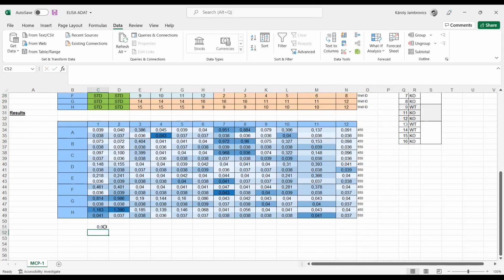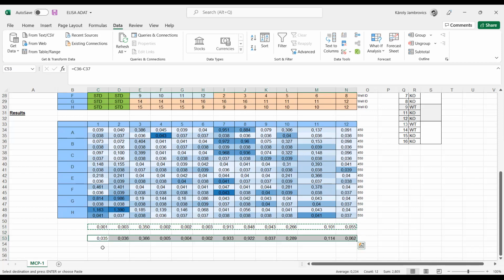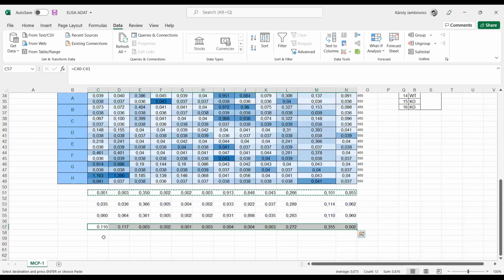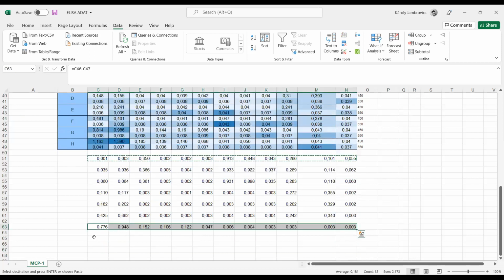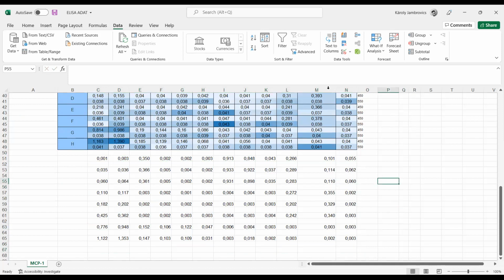the values, as you see here, for example. If you do it one by one, then obviously you can have the same values, but afterwards you don't need these ones, because they are not related to any of these. So I'm going to delete these values.